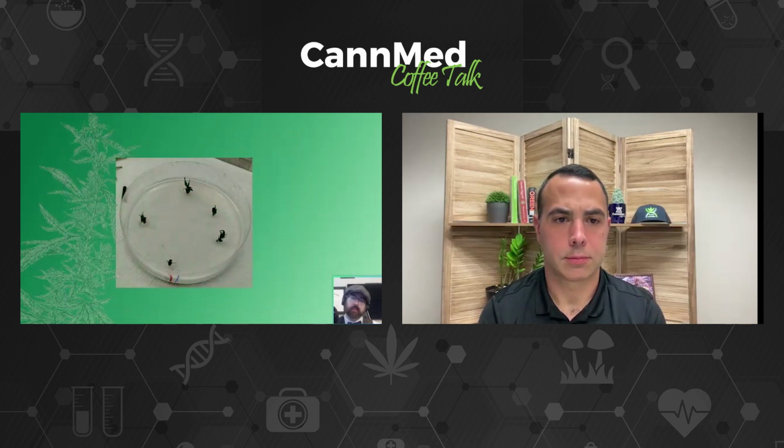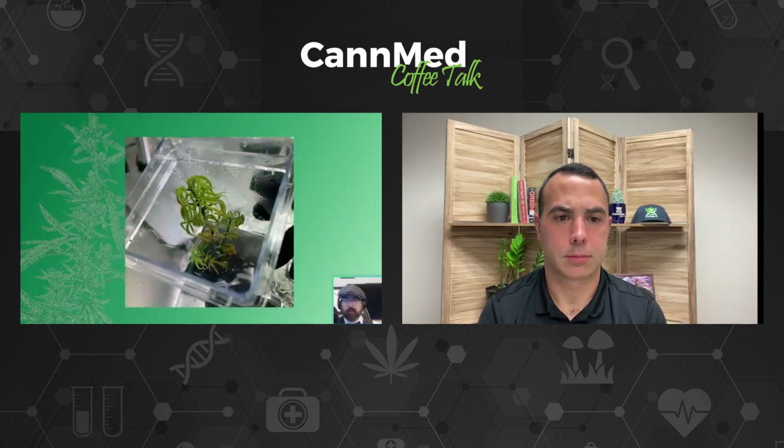And then as they get to a certain size, they start throwing shoots off, and then we cut the shoots off and propagate, cut the shoots off, propagate, until you get basically a lot of plants. This is probably a little bit easier for the audience to see. So that's the basic process of tissue culture.